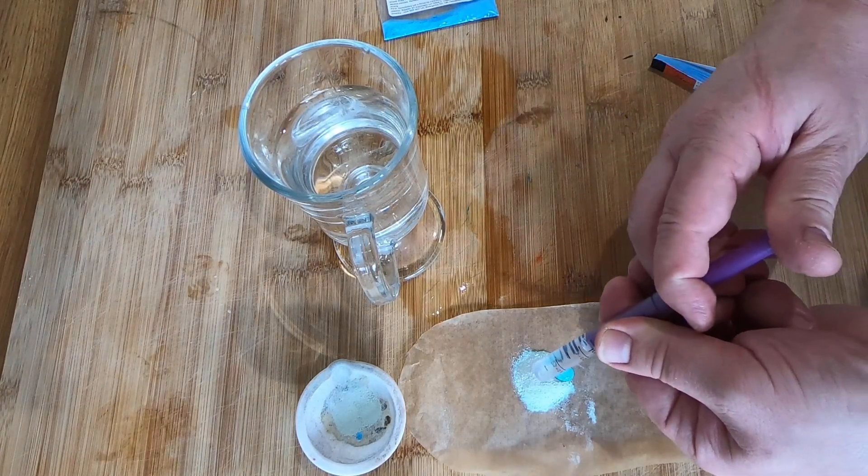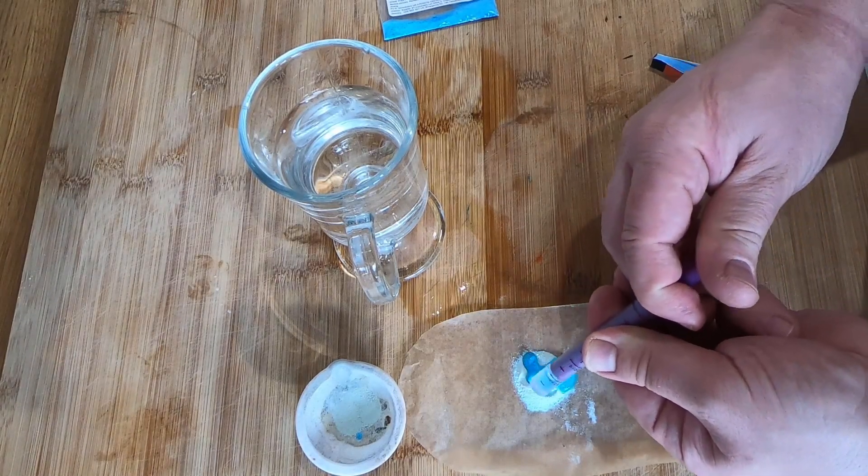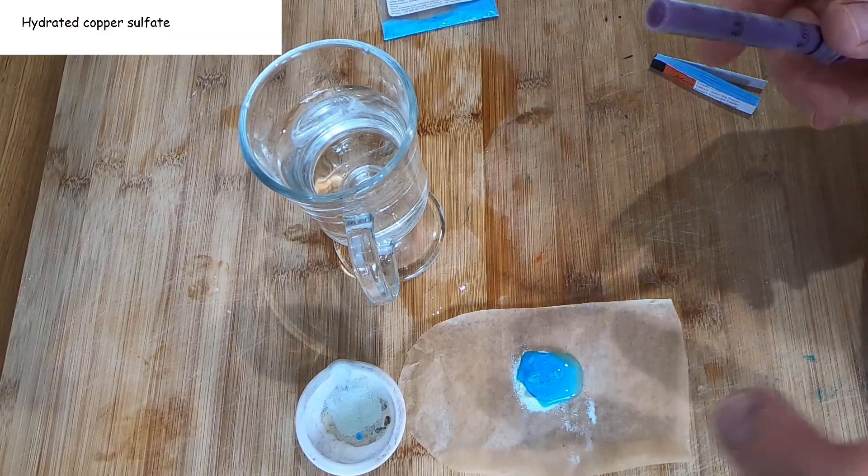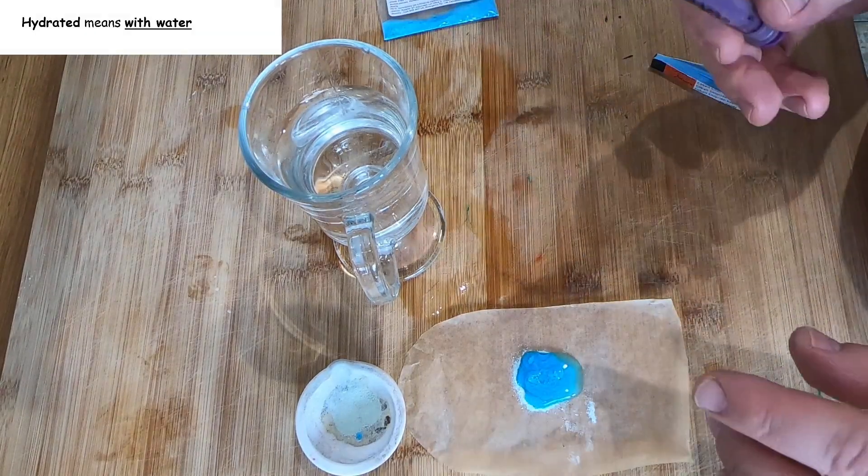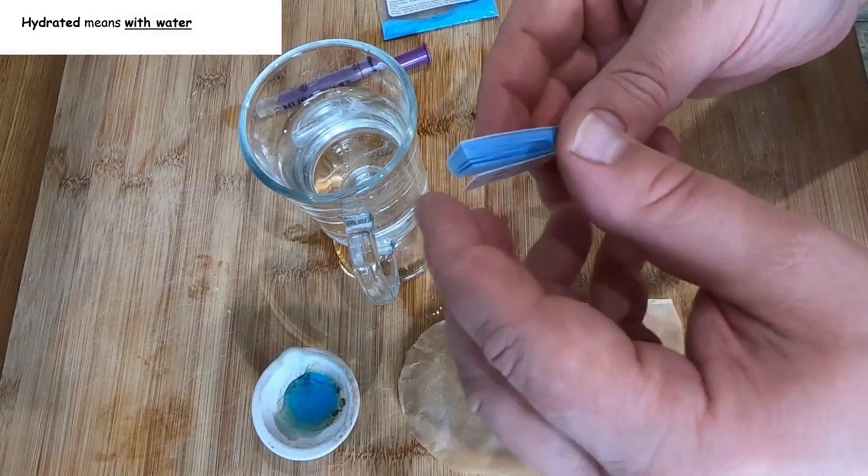So as I add the water back to the anhydrous copper sulfate, it turns blue. And we call this hydrated copper sulfate. So the blue color you see with certain copper sulfates is because it has water in it.